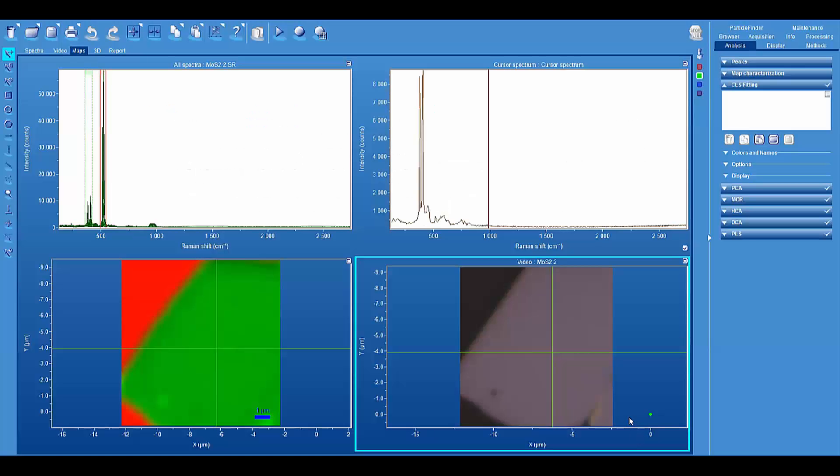Now that we've briefly discussed the important considerations for Raman imaging and some of the experimental details, let's take a look at the results. In the lower right hand corner here, you see a reflected light image of a flake of molybdenum disulfide on a silicon substrate. So here's the disulfide and the dark area, which is a little bit out of focus happens to be the silicon substrate.